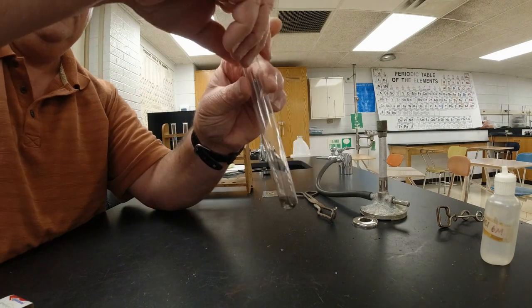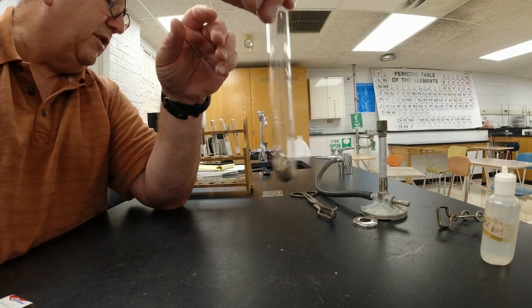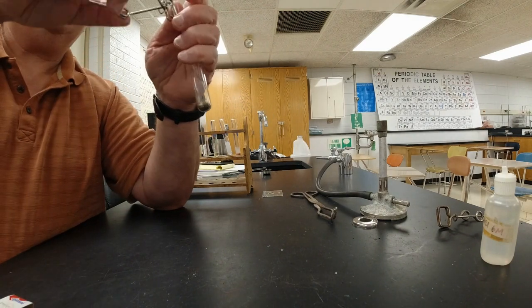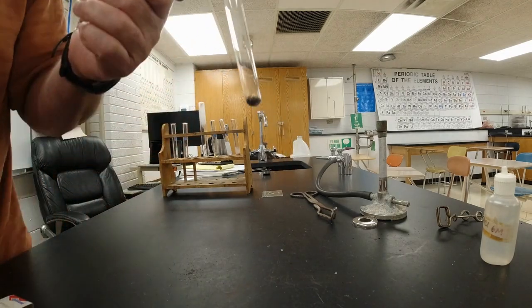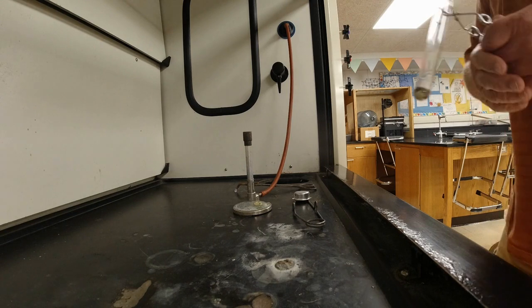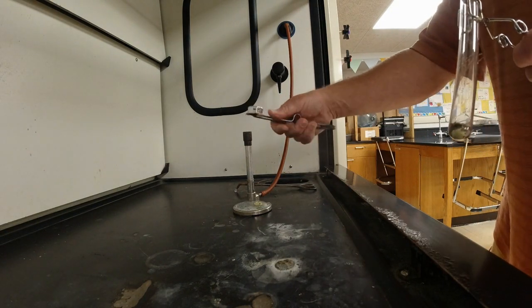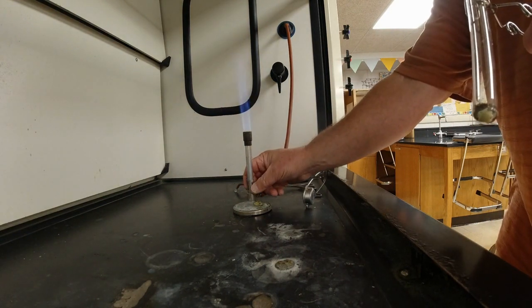I want to mix these things up again because we're going to do something that is actually a pretty violent reaction. I'm going to put this in a test tube clamp like this, and we're going to go back to the fume hood. I'm going to light the Bunsen burner here, get a nice hot flame going.